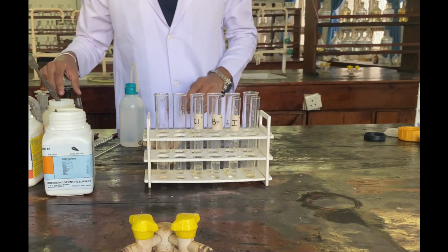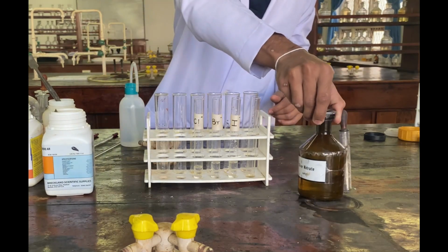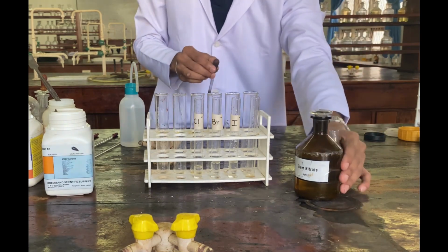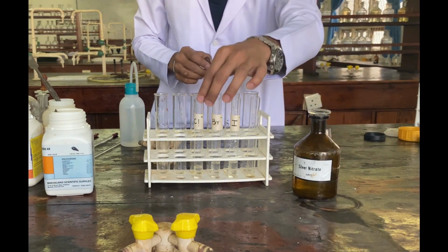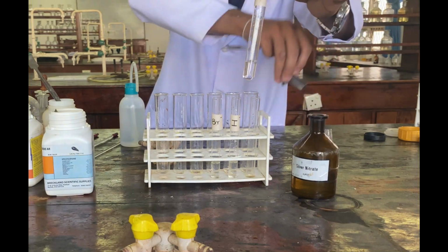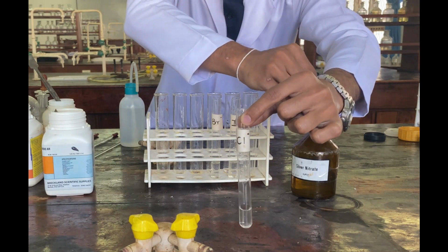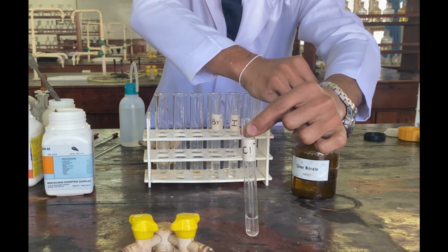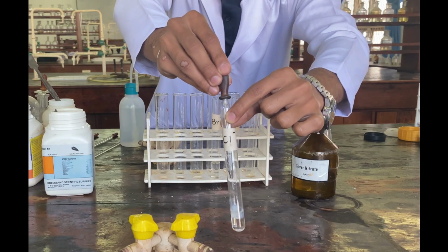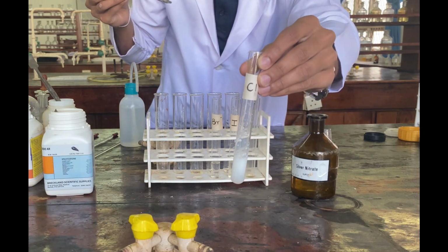In test 1, we are going to introduce a little bit of silver nitrate into each of these test tubes which contain halides. First, we add a little bit of silver nitrate to the first one. Notice that as soon as we do so, we get a white precipitate and it is silver chloride.